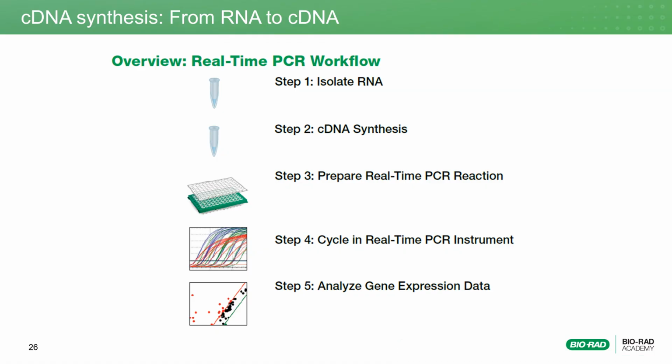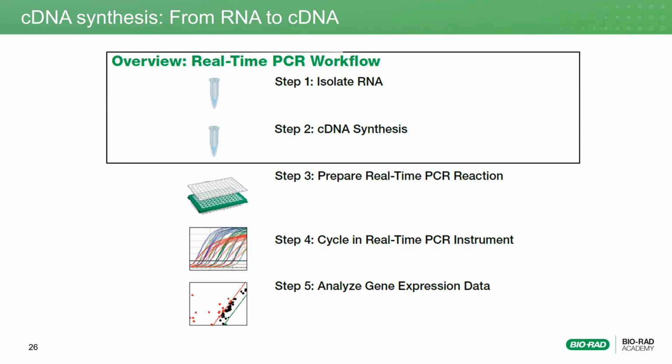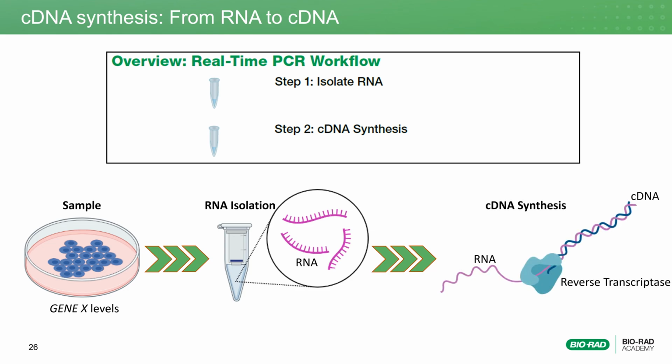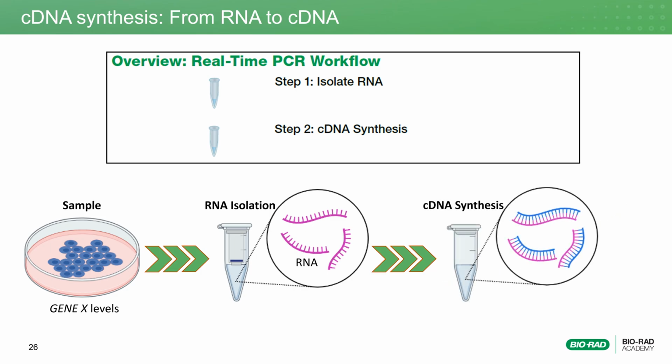Now that we've examined the processes and considerations involved in RNA isolation, let's return to the basic RT-qPCR protocol to examine the next step. Recall that for this module, we'll be focusing on the first two steps of the RT-qPCR protocol. If we revisit the original experimental example mentioned earlier, we can see that the next step after RNA isolation is cDNA synthesis. Let's continue our discussion focusing on the different ways to incorporate cDNA synthesis in RT-qPCR analysis.